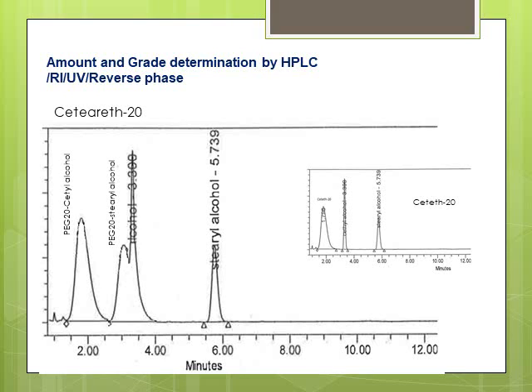And also, you could do the grade determination. You can easily tell if you have Ceteth 20 or ceteareth 20 in the formulation.